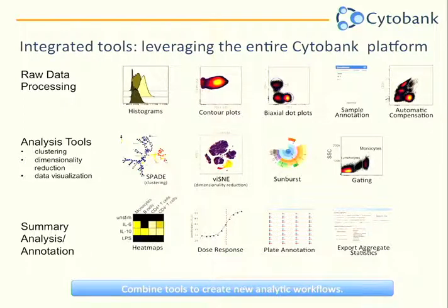So in terms of integration, one of the things I wanted to mention is that I talked a bit about the analysis, the raw data processing, as well as the summary statistics and annotation. I didn't have time to go too much into our dose response or our plate annotator tool, but we have a number of other tools within Cytobank which are particularly useful for large studies if you're running large-scale assays.